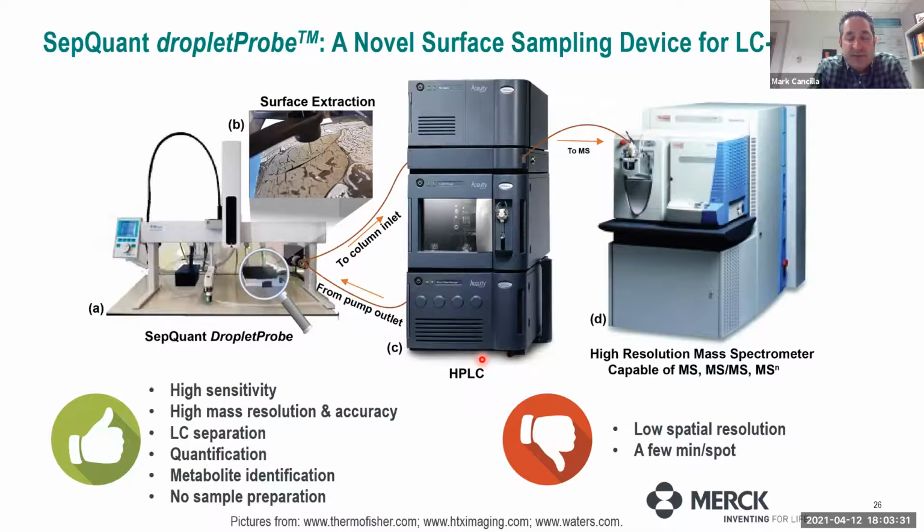So this is the whole pros and cons. I think the advantage is the HPLC or the UPLC, because when you're doing these tissue extractions, you have everything under the sun in there. We have done the extraction to a direct injection, and primarily you're just seeing background molecules. The background is so high. It's very hard, especially at lower levels of your actual analyte, to pull it out. It's hard to get that signal to noise. So I think that's where the disadvantage is. The speed is definitely there, and Advion has a whole platform to do that.